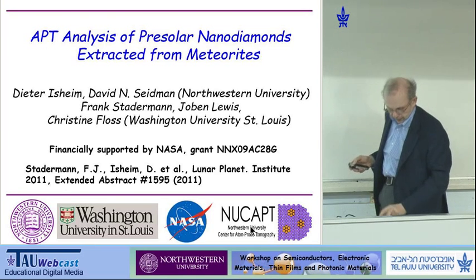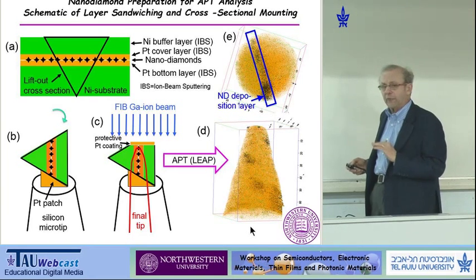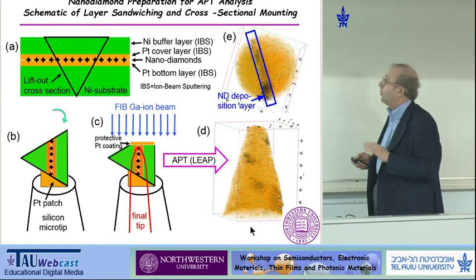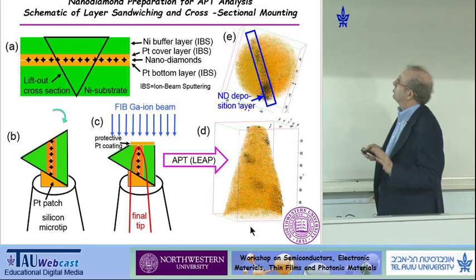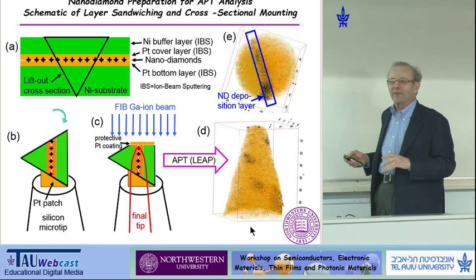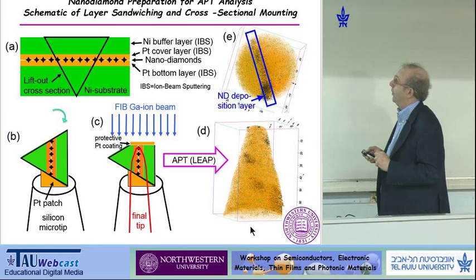Okay, so the first challenge, and it was non-trivial, was to make specimens given these nanodiamonds. And we weren't sure whether we could do it, and we told them, it's not going to be easy. And they said, don't worry, it's important to us. There are supposedly 900 cosmochemists in the world. So when they have a meeting, 900 of them plus their students attend.